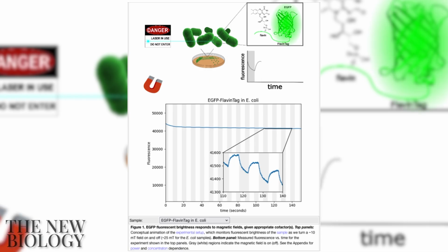But the major anxieties were, okay, it's not noise, but it's probably heating because we use an electromagnet. Oh, well, hence the Popsicle stick. No heating from the Popsicle stick. Oh, well, it's probably vibrations from the Popsicle stick. Well, the electromagnet doesn't vibrate, and the signal looks the exact same if it's a permanent magnet or an electromagnet. Oh, maybe the magnet's pulling on the optics. Well, swap in a sample, like, for example, the purified protein is still fluorescent, but it's not magnetoresponsive. Oh, we don't see the effect.